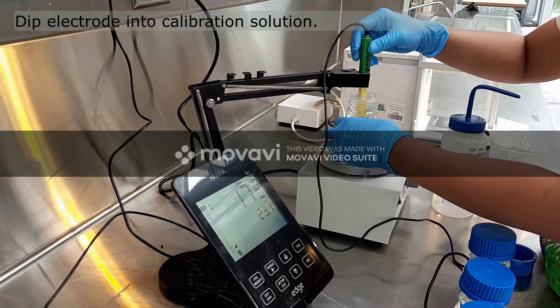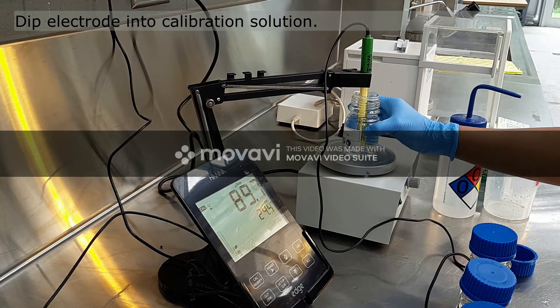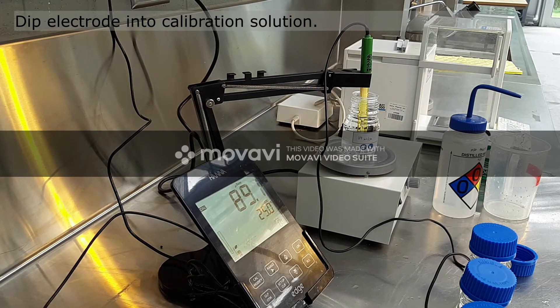Now dip the EC electrode in our calibration standard. Today I am using 84 microsiemens per centimeter. Ensure that the electrode is submerged until the black line mark. Also, make sure that the electrode is centered horizontally in the flask and not touching the bottom of your flask.